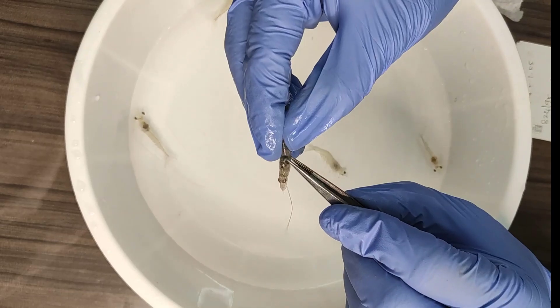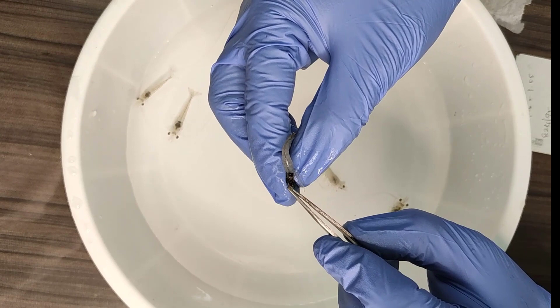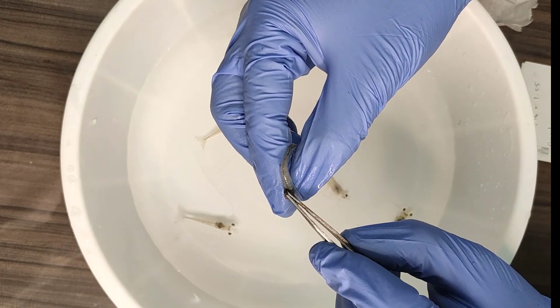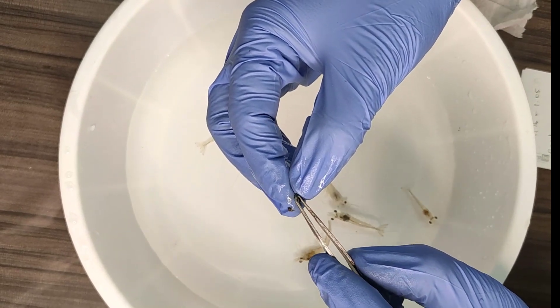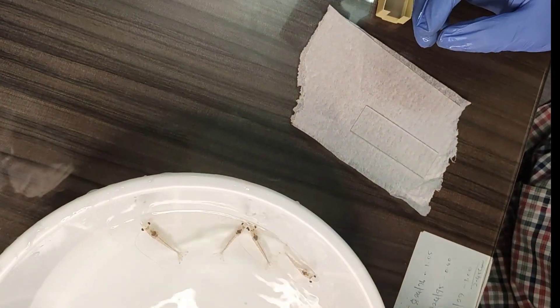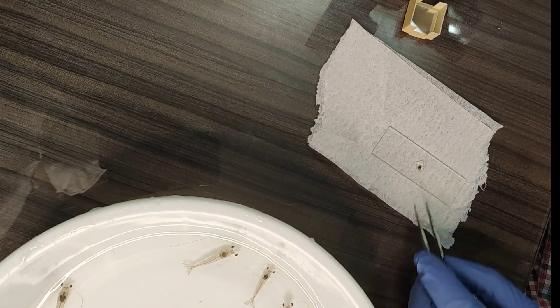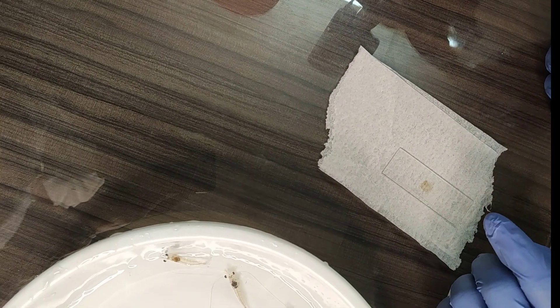Select the small shrimps from the suspected pond. Remove the carapace and expose the hepatopancreas. Take a small piece of hepatopancreas with the help of forceps — a small piece is enough. Place it on a glass slide, add a drop of water, place a cover slip over it, and gently press it. Now your slide is ready.